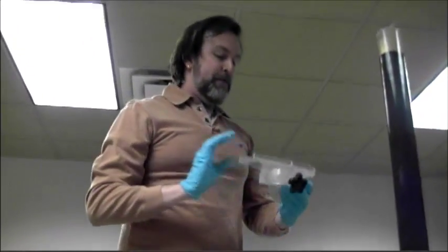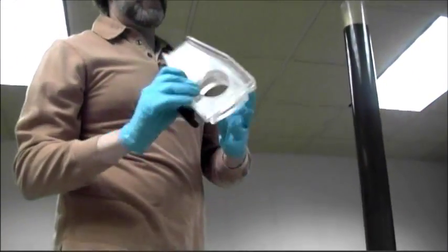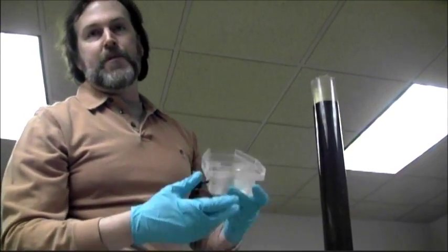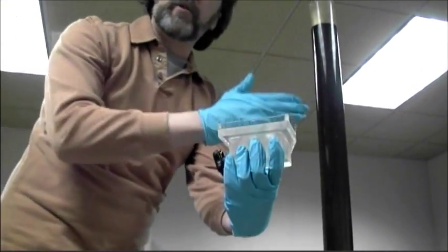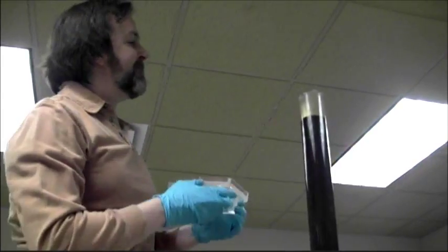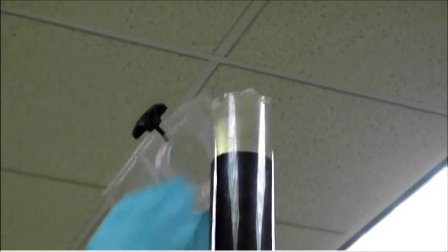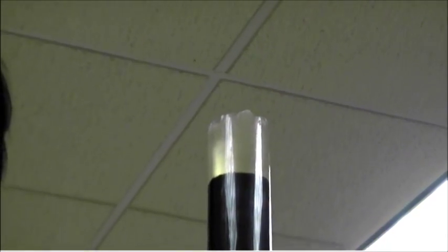So this is the tray for extruding. I'm just going to put this on top and it tightens onto the tube so that we can extrude the sediments up. And whenever the sediments come up out of the hole, we can scrape them off into bottles. The first thing we're going to do is get rid of all of this layer of Zorbitrol that's solidified at the top.